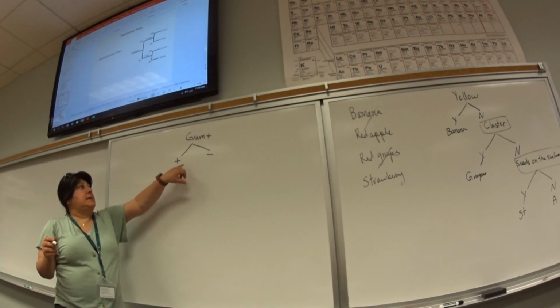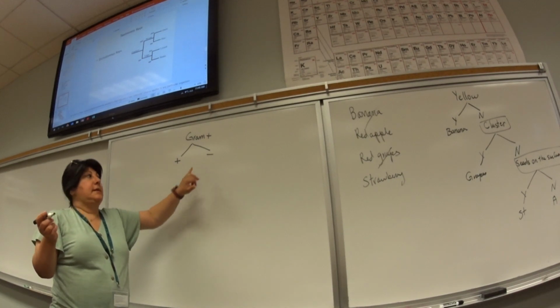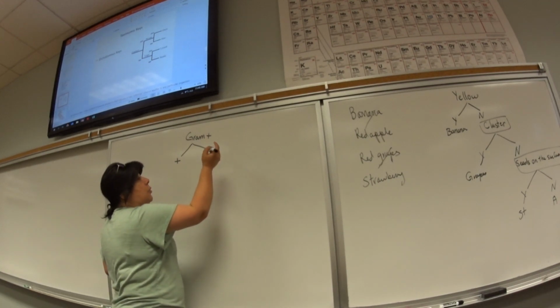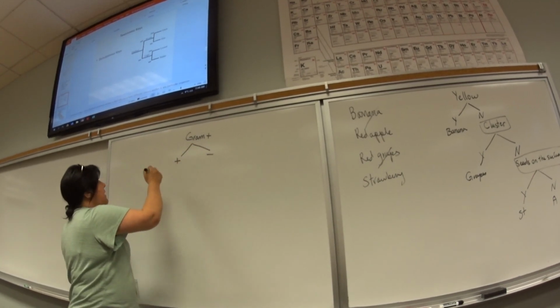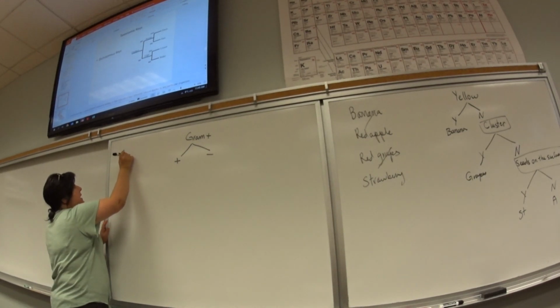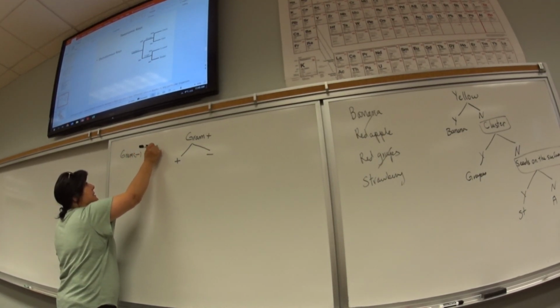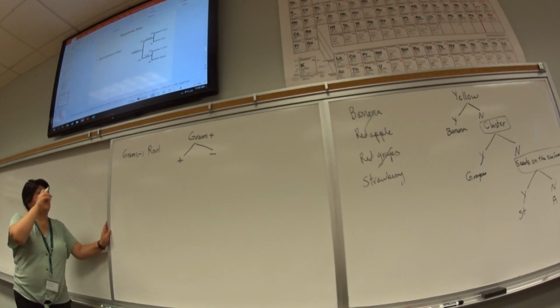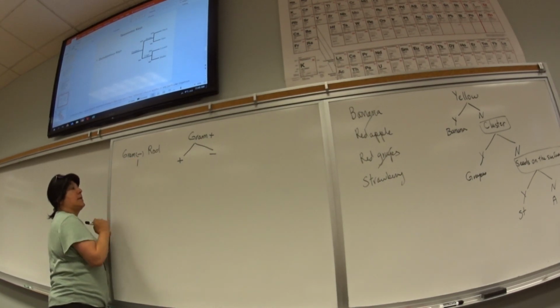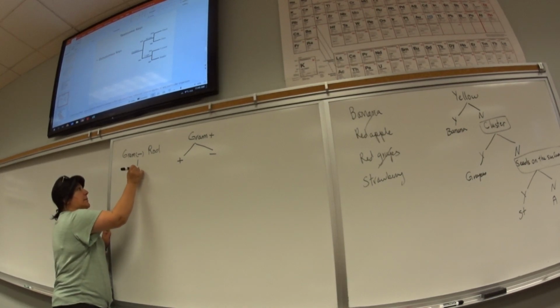Then let's say it's Gram negative. From the Gram negative, the next thing you did was oxidase. Or is it rod or coccus? Again, you can start it like that. You can start by just saying it's a Gram negative rod. That is an acceptable start for you too. So that's my initiation, Gram positive, Gram negative rod. It's one of those. The next test that I did was oxidase.